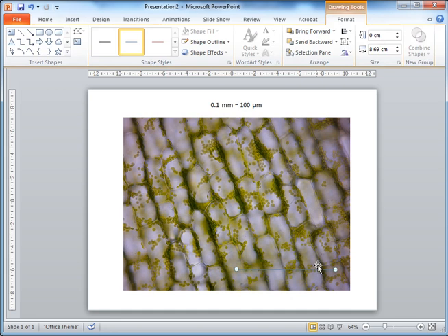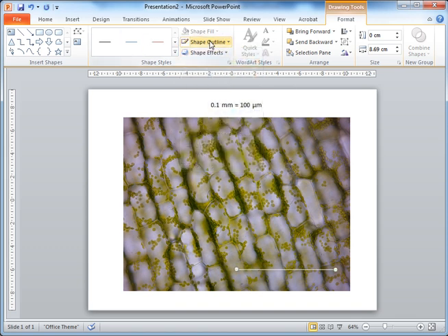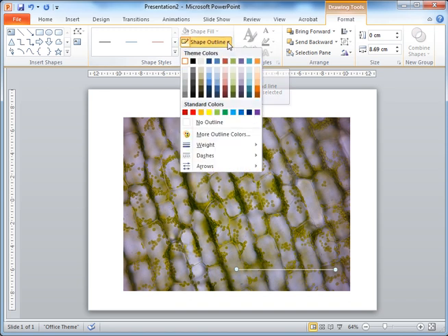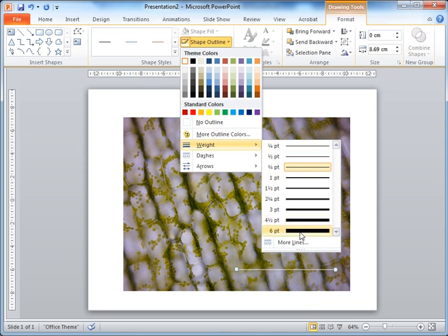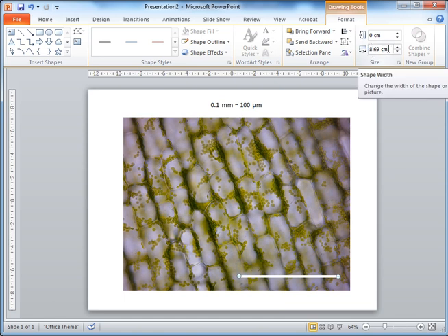To make the line visible against the dark background, make it white. Double-click the line to bring up the Drawing Tools Format tab, go to Shape Outline, and select white. We also want to make it thicker so it's easier to see — go to Shape Outline, then Weight, and set it to 6 points thick. In the Format tab, the line is currently 8.69 cm long, but we need it to be 4.9522 cm, since that equals 100 micrometers.